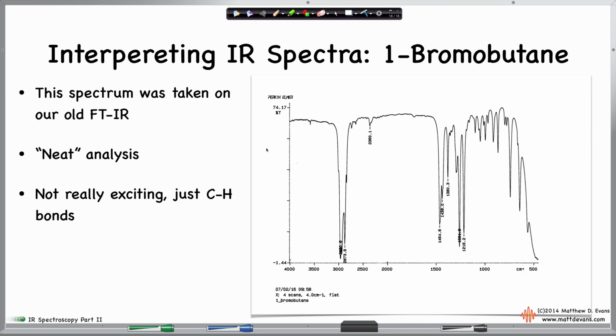here. I'm not entirely sure what my point was here because I had plenty of examples already, but 1-bromobutane, of course, looks like so. Really, in an IR, it's kind of a boring compound. The only thing that we see really is the normal CH stretches, and this bond right here, C-Br. I'm sure it's here somewhere in the IR spectrum, but I forgot a long time ago.